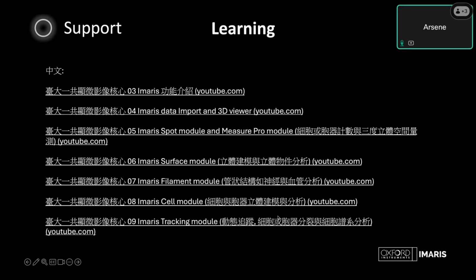You can also find a lot of YouTube videos recorded by our customers from training sessions, including the Chinese part from National Taiwan University and the English part from our customers in probably Australia and other regions. So we have a lot of resources you can utilize online to learn IMARIS by yourselves as well.